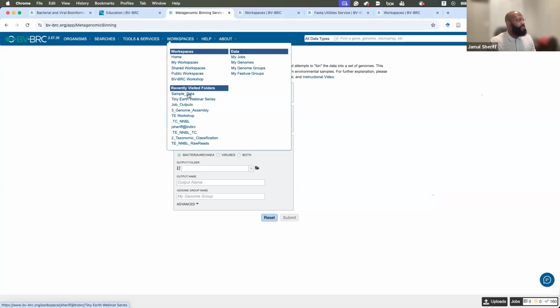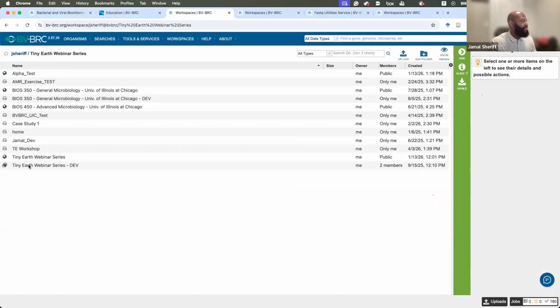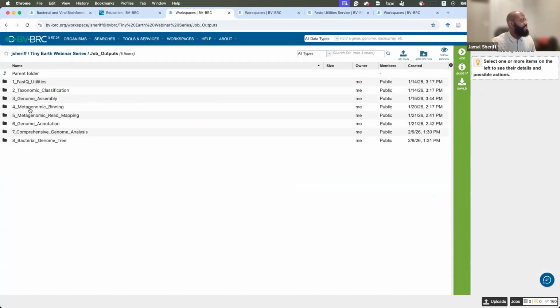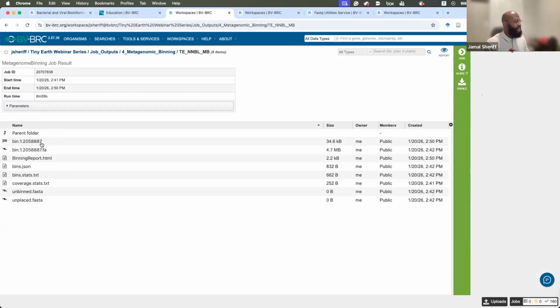Now we want to look at our job results. You know what I'm going to say already. You want to find your job output folder, number 4 for metagenomic binning. We want to select the metagenomic binning job.